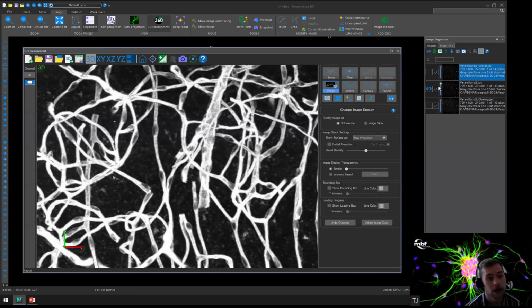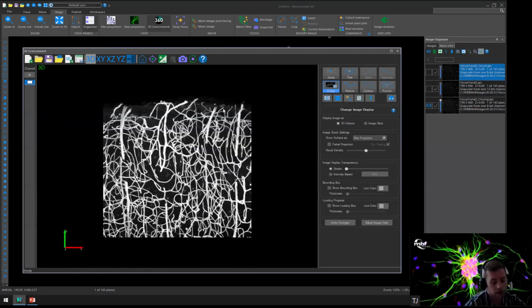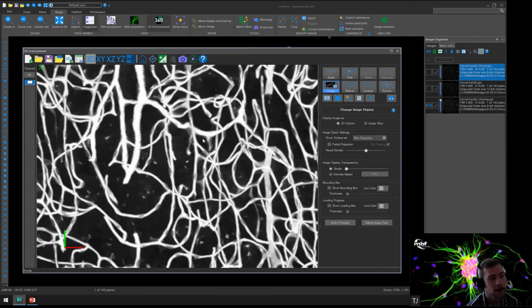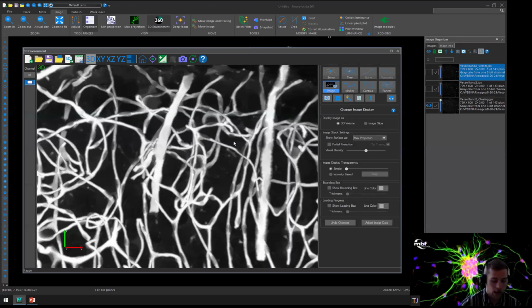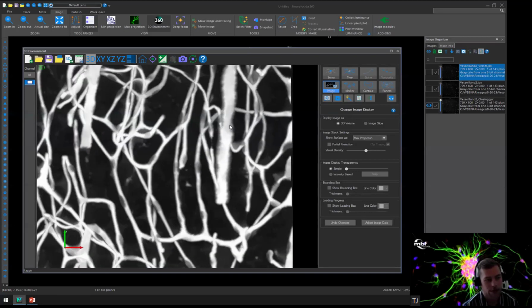When we apply the closing filter, we're looking to create those bursts out from the brighter pixels to create a closed environment in smaller areas. Here we can see that it did a nice job of creating a firm center for most of this unfilled vessel. But for the vessel where the edges were a bit trickier to complete and it was much more dispersed with staining, there are still some gaps and some unfilled edges.